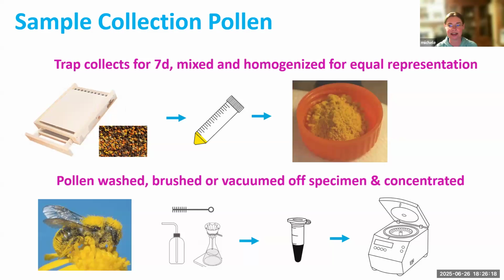For pollinators, it's actually kind of hilarious to see a bunch of grown adults very gently brushing bees. When we get the pollinator, we bring it to the lab. We very gently brush off the pollen basket. Some of these are teeny tiny, but we generally can collect enough pollen, and then all the samples end up going in this fancy pants machine that I have pictured on here called a centrifuge. Again, it's noisy, it spins fast. It's very popular with the 7-year-old. But all of these steps are basically simply to take that sample and reduce it down to just getting at the pollen.